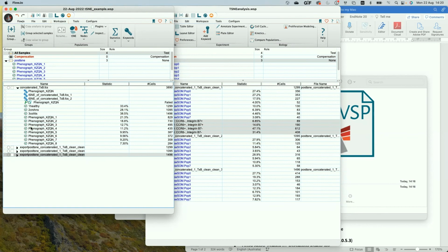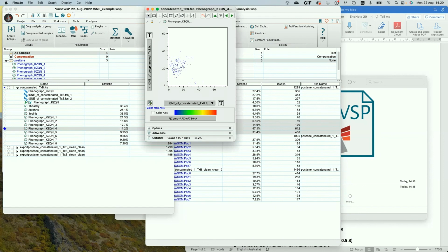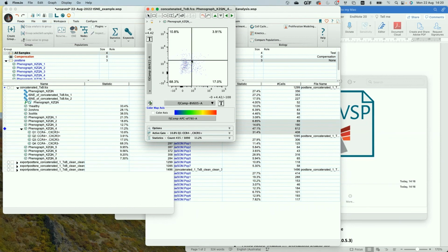And by doing that, on this total population here, if population 4 is of interest, you can use your clustering analysis first to get an idea of the expression of this marker. Then you could define a minimum gating strategy and think, right, if I get to my total CD3 positive cells, what are 1 or 2 gates that I could use to define this population by, say, 90%? And you could say, oh, I'll try this gate, and then maybe I purify it by something else.